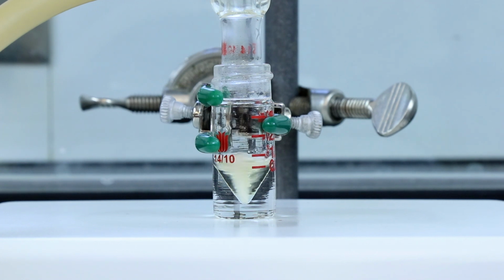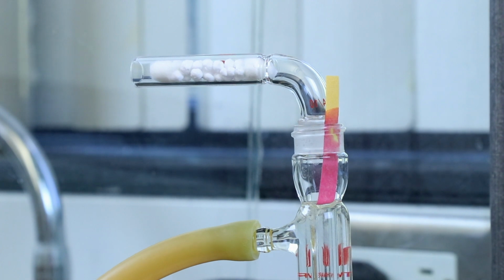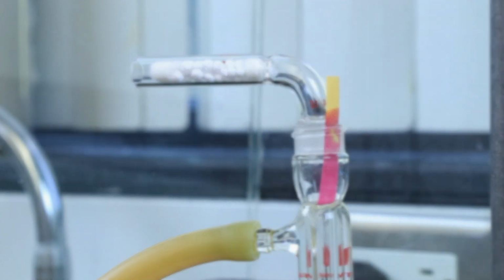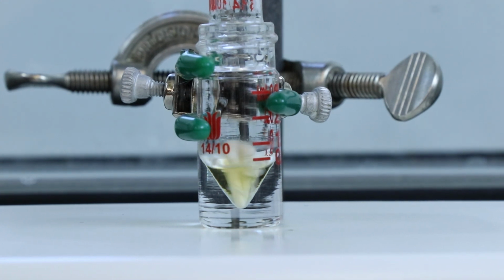And now I'll just let this reflux for 30 minutes, making sure to monitor the reaction so that the color doesn't get too dark of a brown, but remains a light brown color. If we check the pH strip, we see a red-pink color, meaning that there's an acid present, which is a good sign that the 1,3-butadiene is being formed. And this light brown color is also a good sign that the reaction is happening, so things are looking good right now.